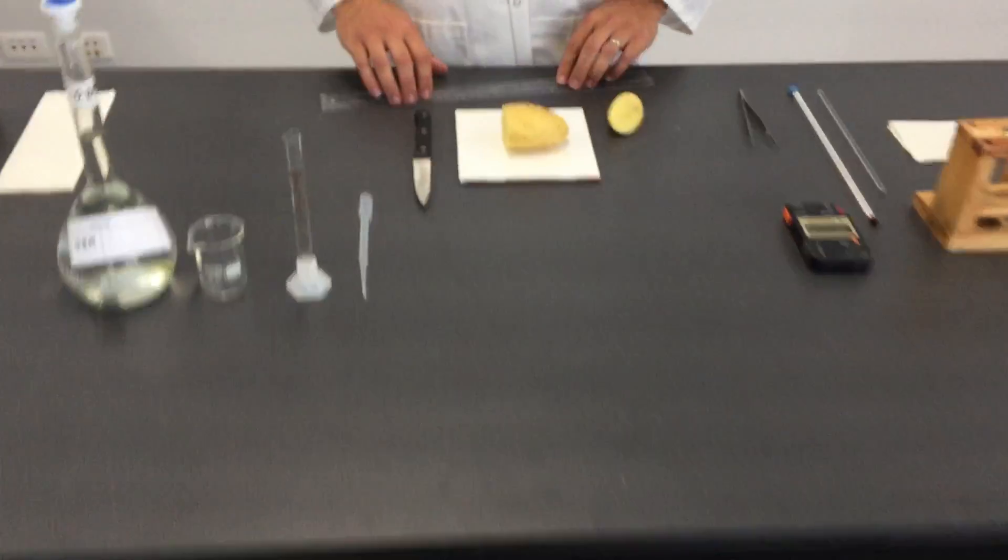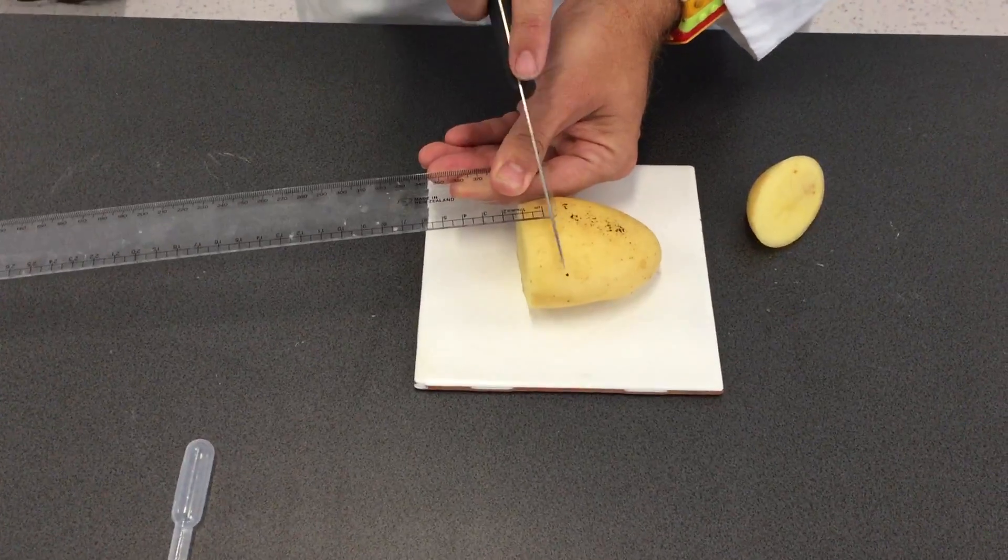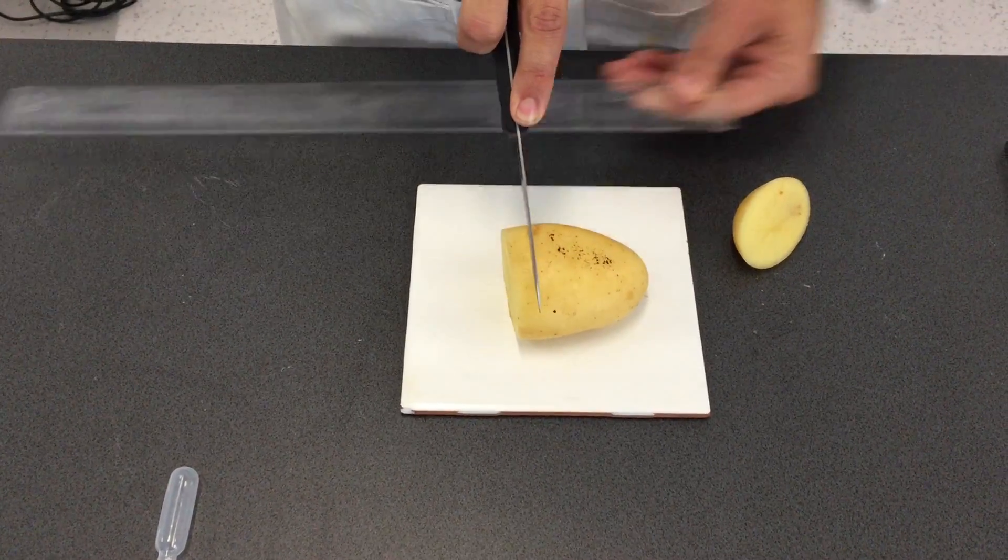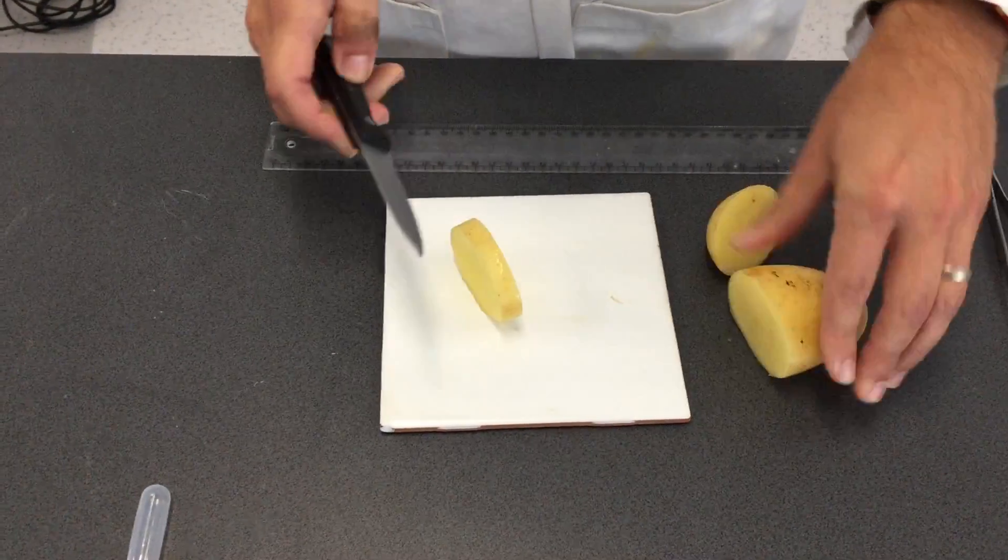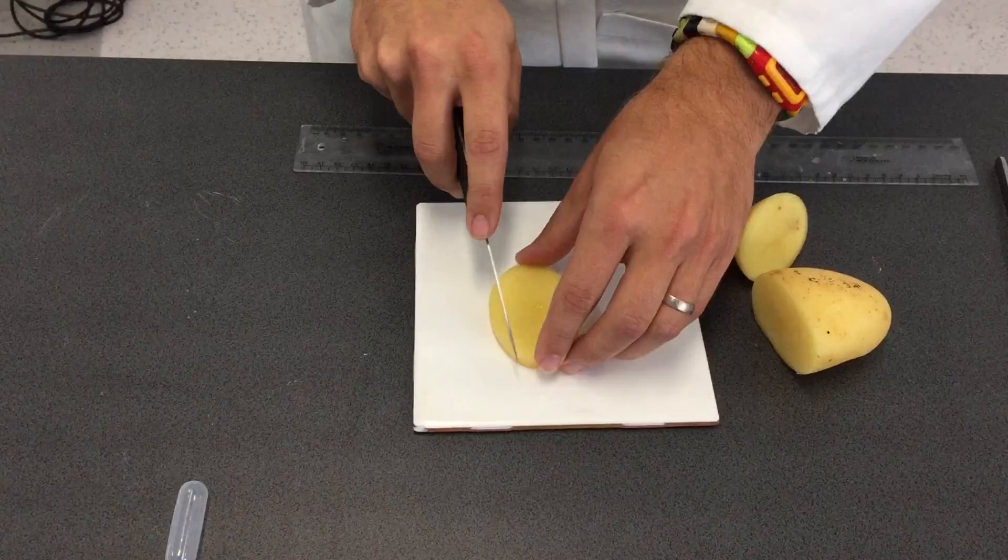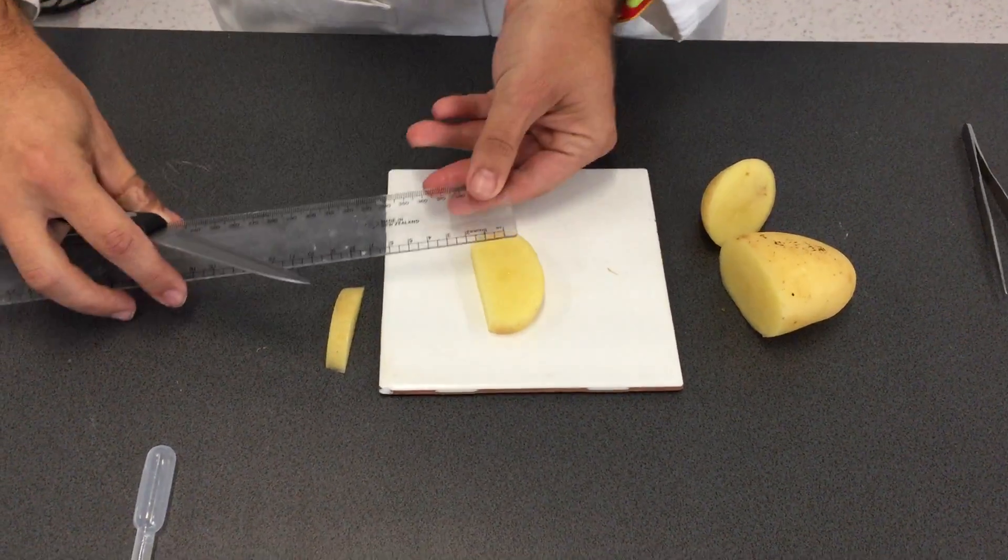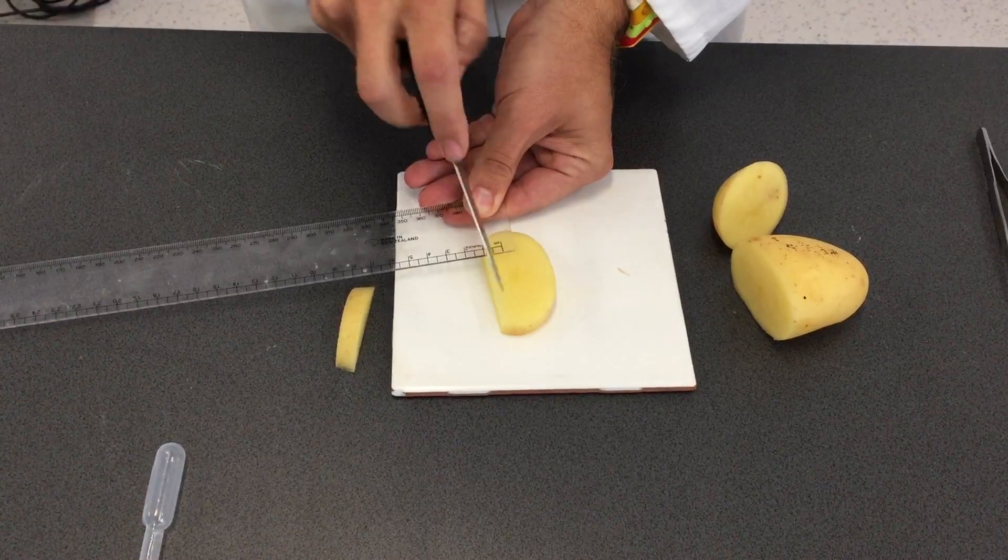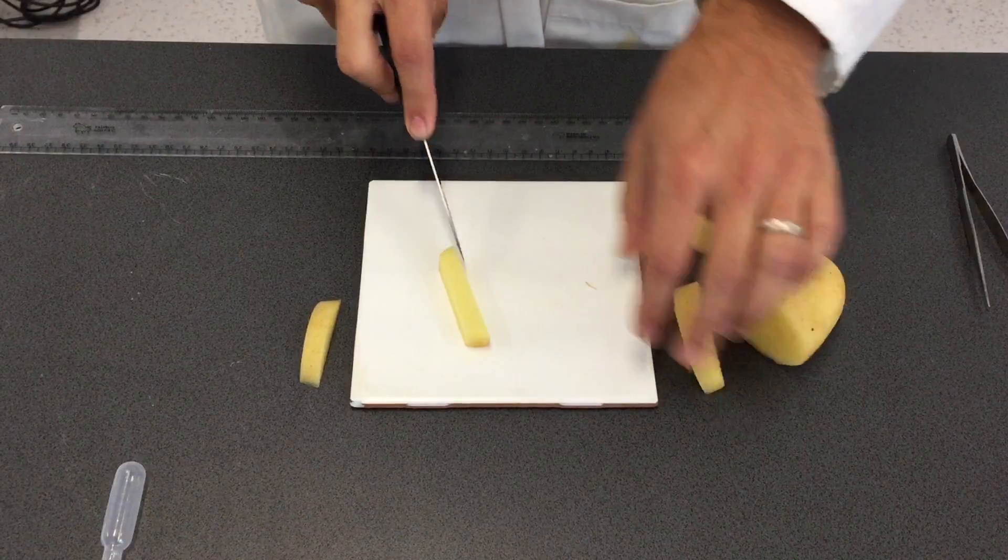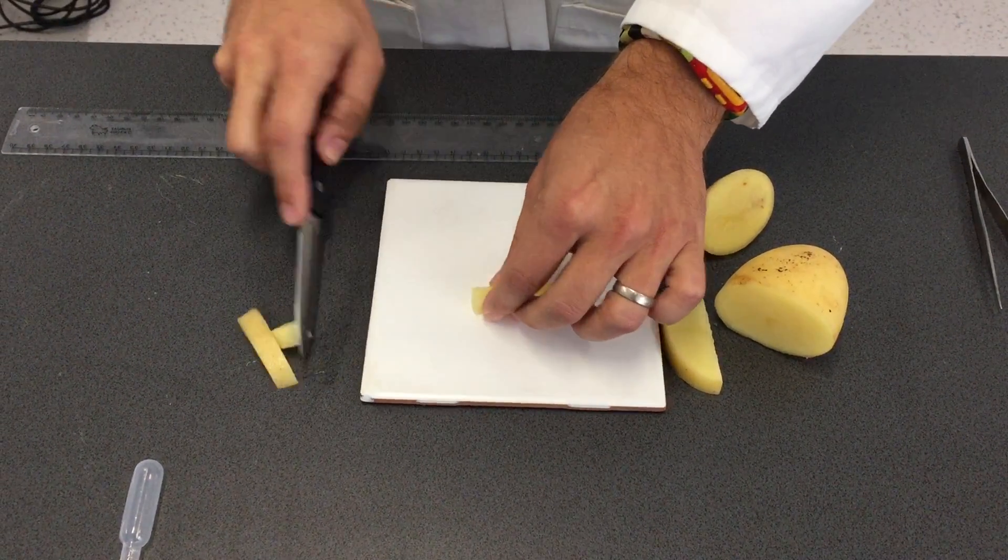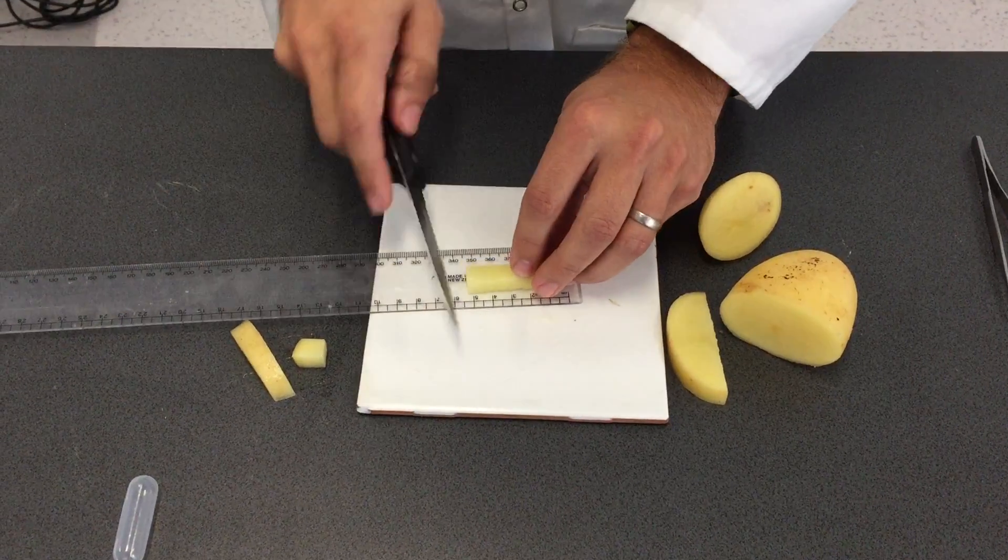So I cut the end off already. The process here would be to measure one centimeter and mark that using the knife, and then from there get an even parallel slice. Again we can slice that, then measure to get another even one centimeter slice. And now three pieces that are one centimeter cube.